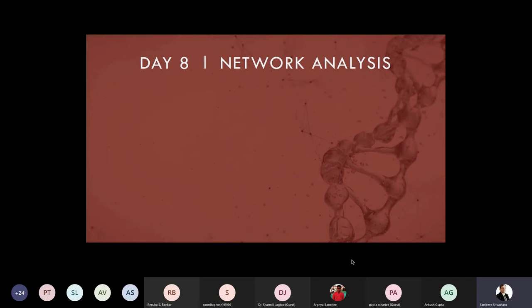Omics research throws up a lot of data which is very hard to interpret using traditional methods. Network analysis is a crucial tool for analyzing high-throughput proteomics data. In network analysis, we evaluate how nodes relate to one another to provide a structure that helps reduce the complexity of underlying data. Using a network analysis tool, one can easily interpret the biology behind those extensive datasets that mass spectrometry-based studies usually generate.